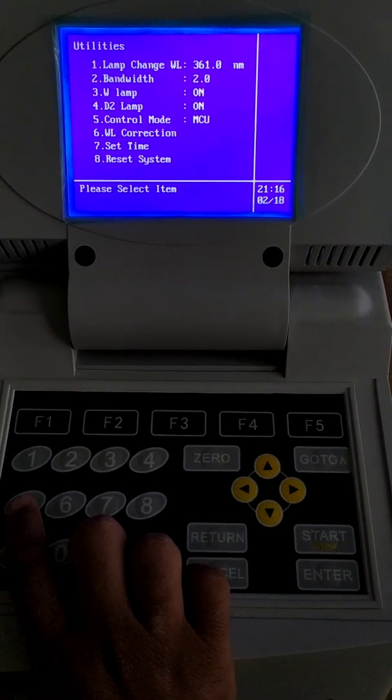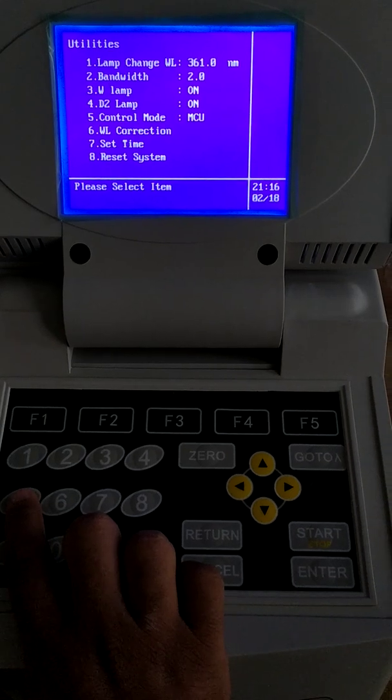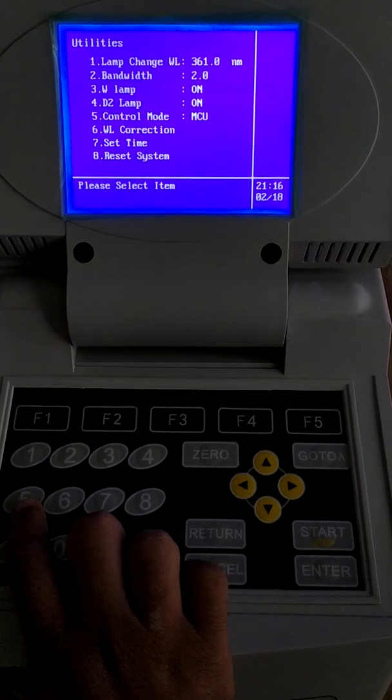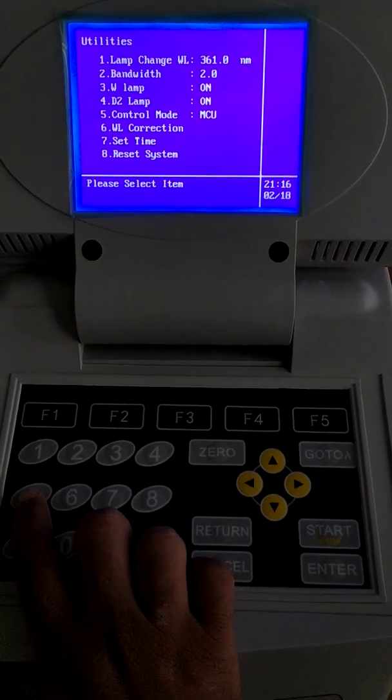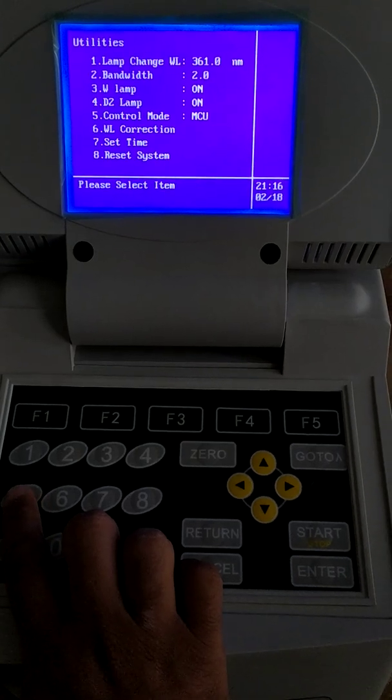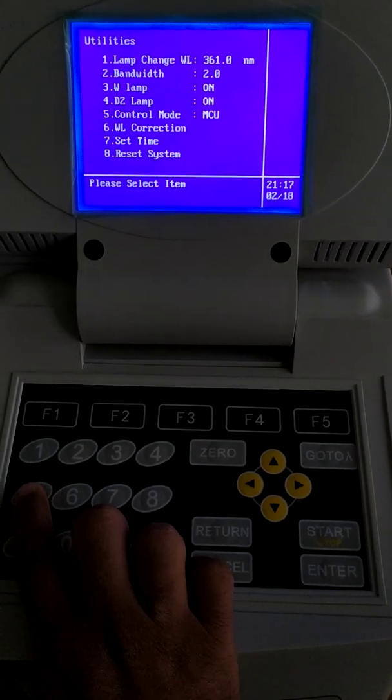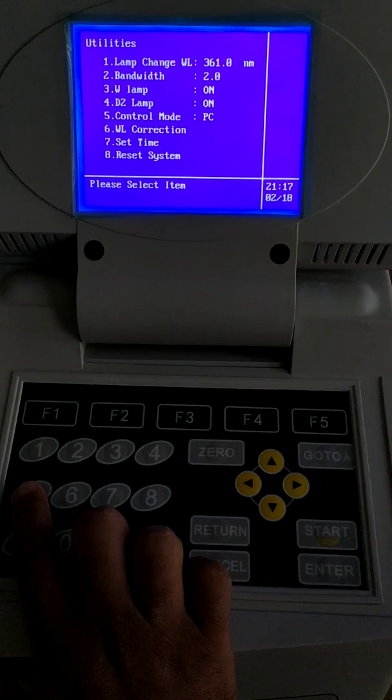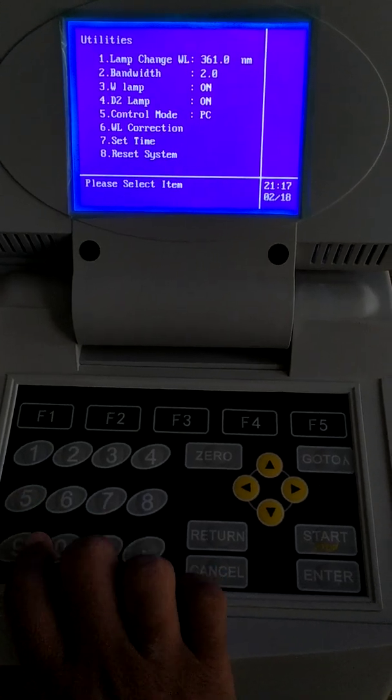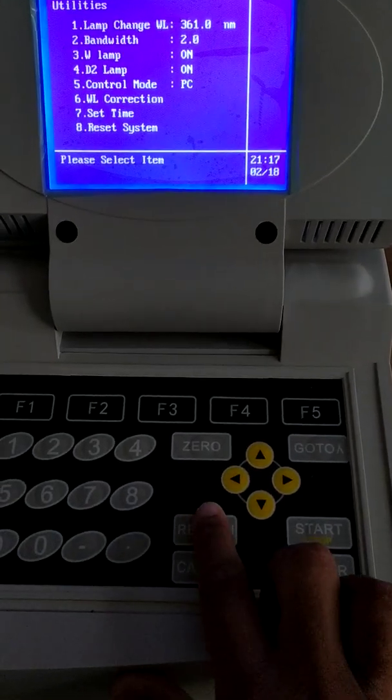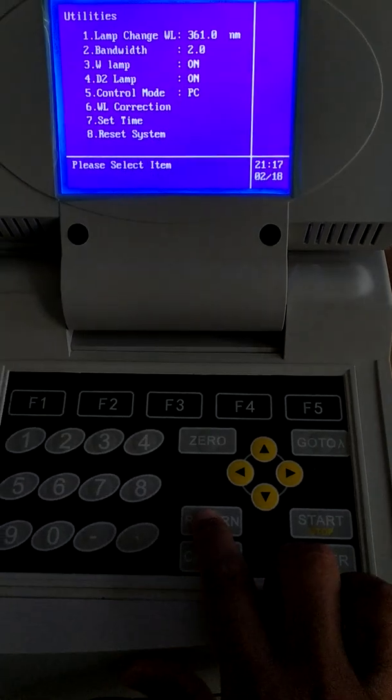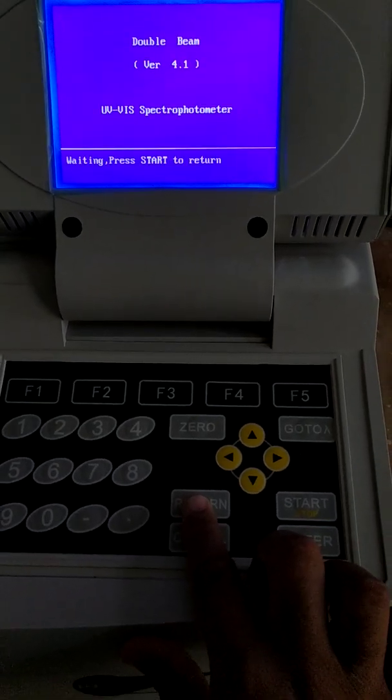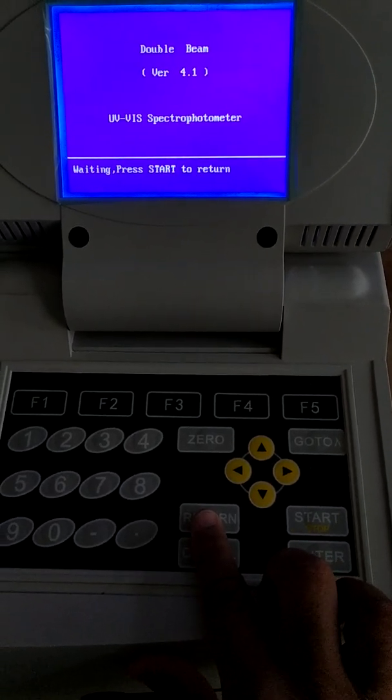To control through PC, change it to PC control and press 5 to convert it to PC mode. Now it is on PC mode. Press return to initialize the mode. It is waiting for computer input.